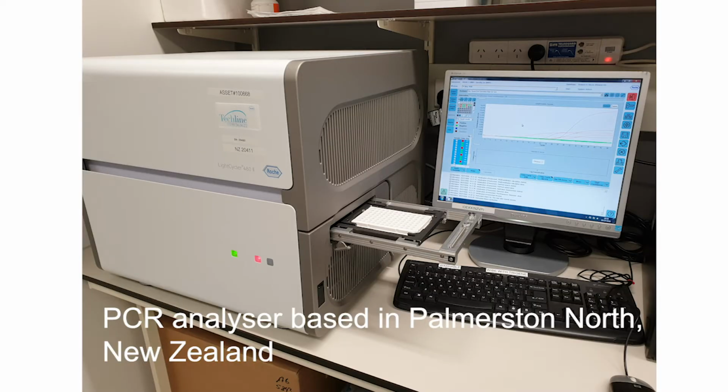What are the main steps of real-time PCR? Two major steps. The first step is nucleic acid extraction and purification. Currently, extraction methodology can efficiently extract nucleic acid not only from blood samples, but also from fecal samples, semen, body fluid, tissues, and several other sample types. In IDEXX Laboratory, we are using an automated extraction technique, which is the most efficient way to ensure optimum and consistent nucleic acid quality, called bead extraction.